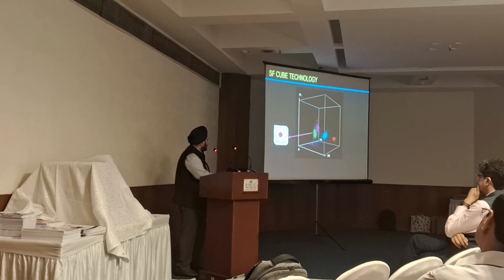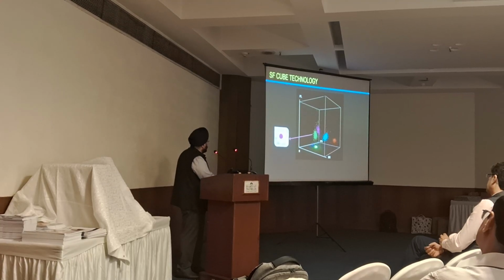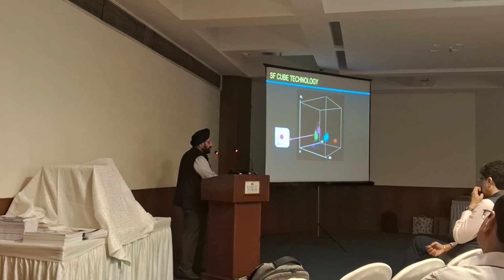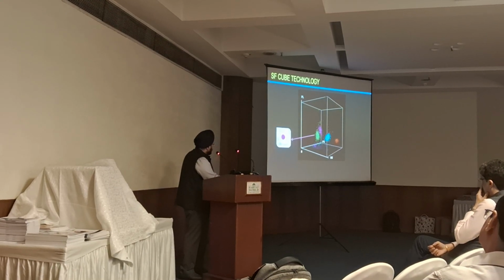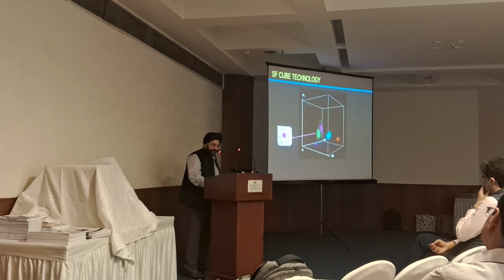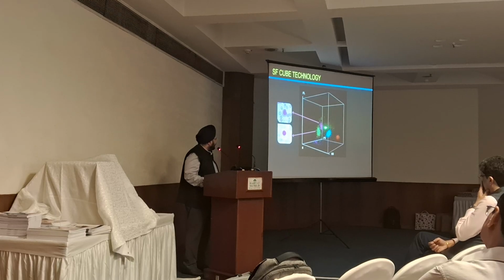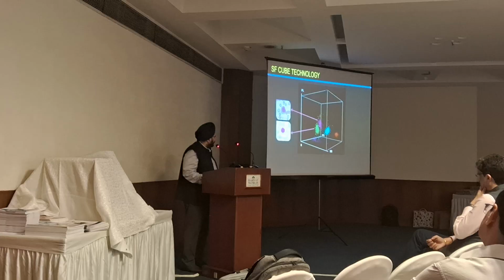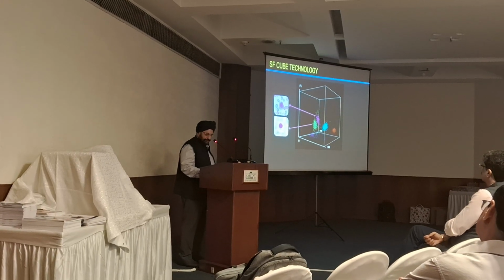Look at these green dots here; these are nothing but your lymphocytes. You can see that they are on the extreme left of the side scatter, which means they have the least granularity. On the forward scatter, they are placed a little in the mid segment, with this pink cell line just ahead of it. This pink cell line is the monocyte. Obviously monocytes are bigger than lymphocytes, hence ahead of the green area. But both of them have very little granularity, so they are on the left side of the side scatter.